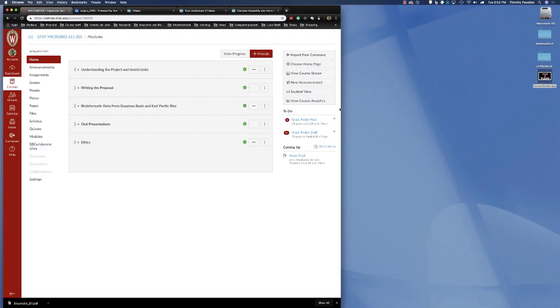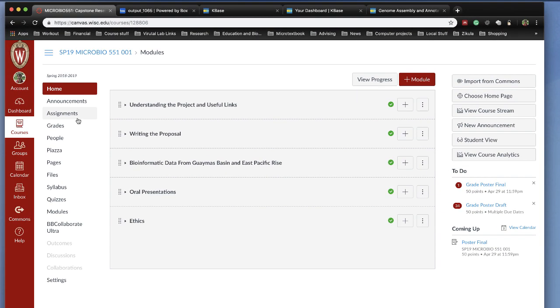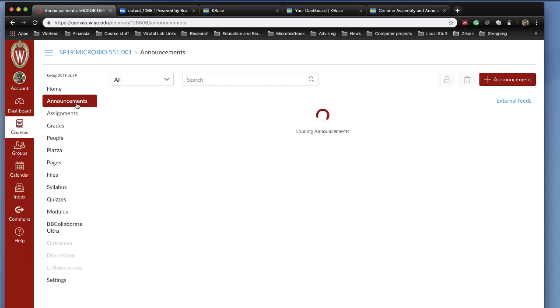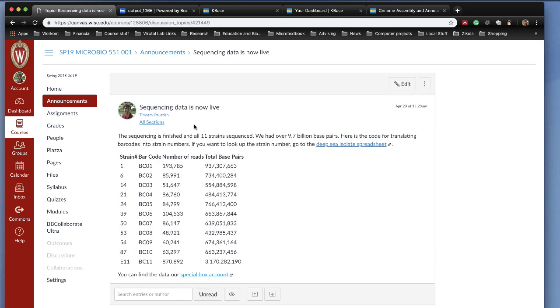Good evening! The sequences are in and you can start analyzing them to your heart's content. To get to the sequences, go to the Canvas page, which is shown right here. Click on Announcements, and the first announcement is the sequencing data is now live.